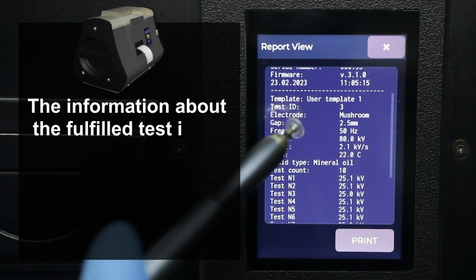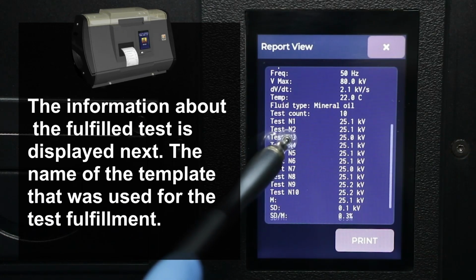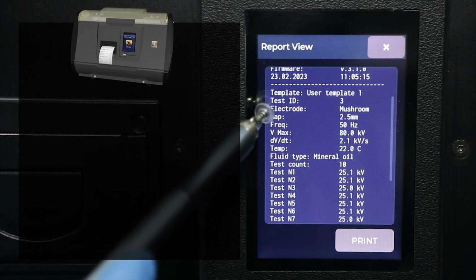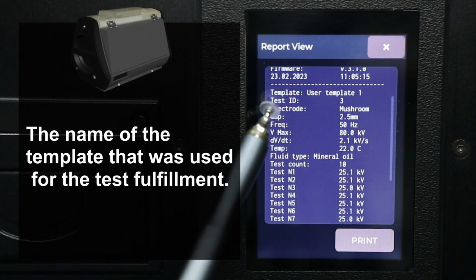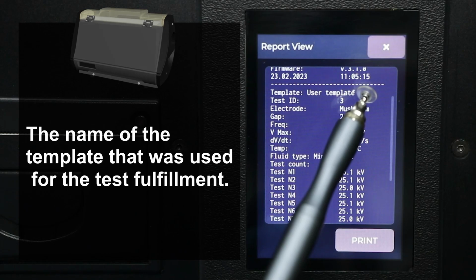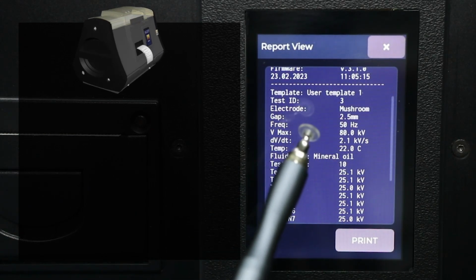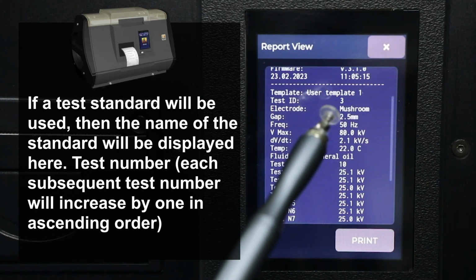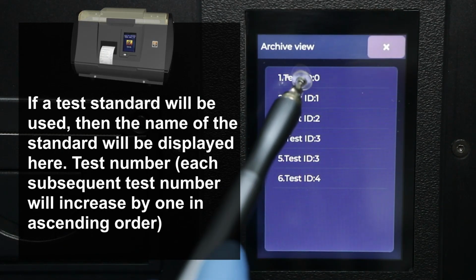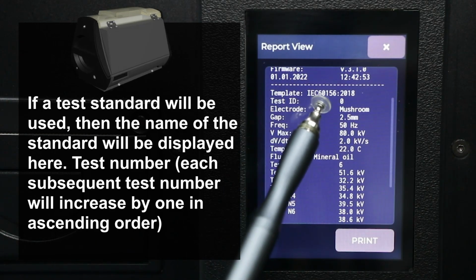The information about the fulfilled test is displayed next. The name of the template that was used for the test fulfillment. If a test standard is used, then the name of the standard will be displayed here. Test number. Each subsequent test number will increase by 1 in ascending order.